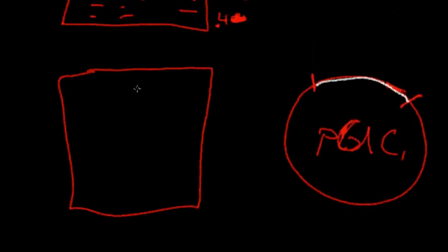We can take our mixture of DNA, which is just this syrupy mixture. We inject it, and it's a combination of stuff, so it'll be both of those. We inject it in a well here, and then we run it out. Okay, and then the big native remaining pUC1 will give us a blotch here, and then the small strand that we actually cloned will travel a lot further, and it'll give us a band here. We see this, we know that our cloning was successful, and that we were able to clone the gene.